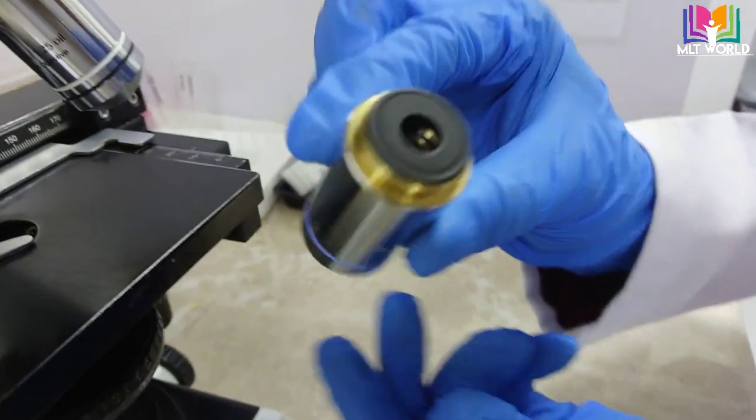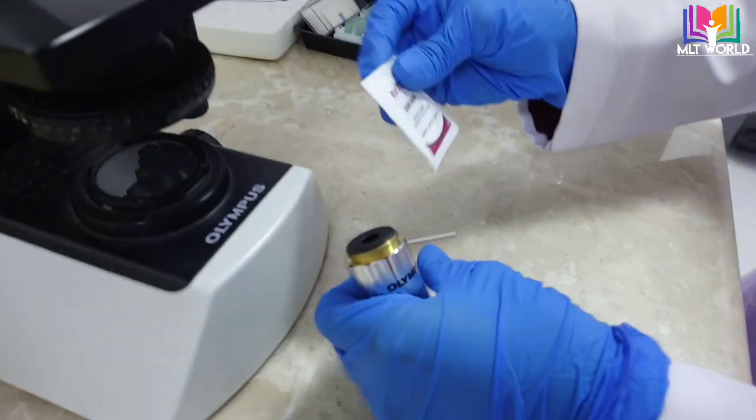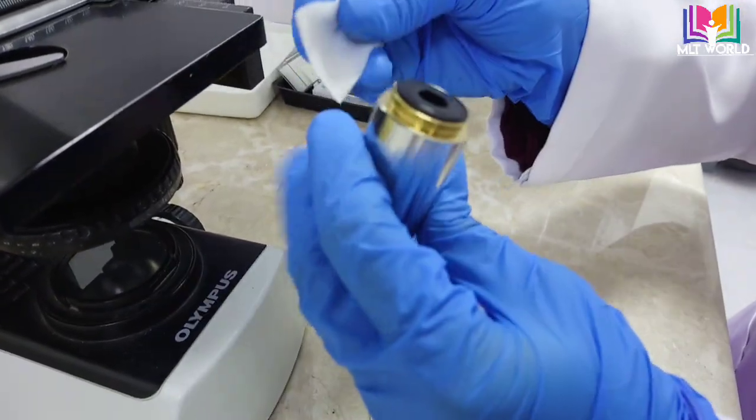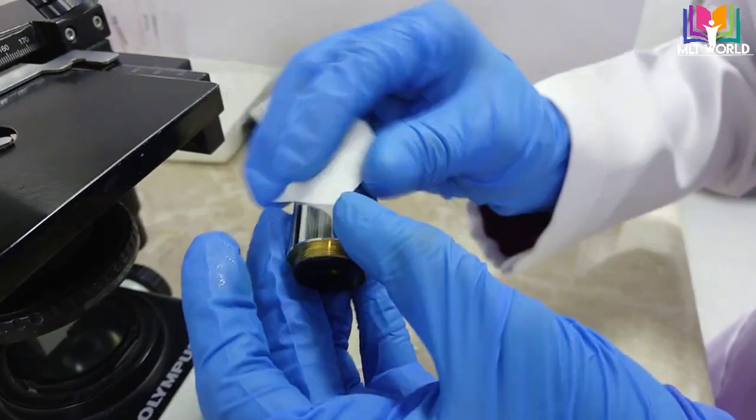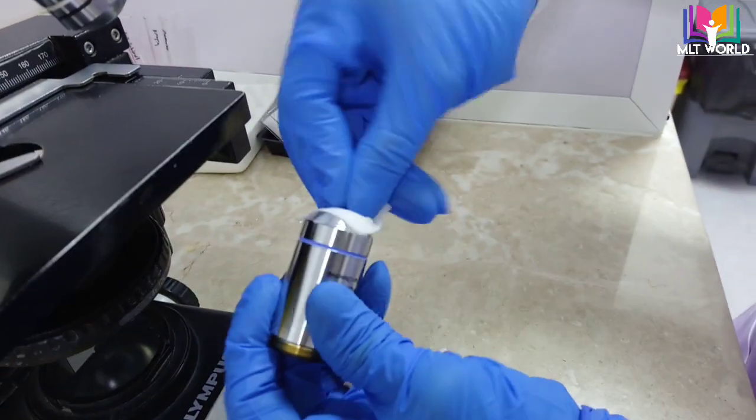Now we need one alcohol swab, and we will try to clean the lens from outside and inside. Like that, you will clean the sides. This area is more important; here we will clean.